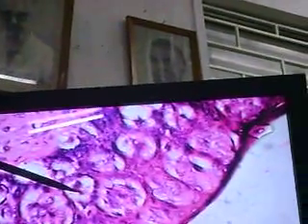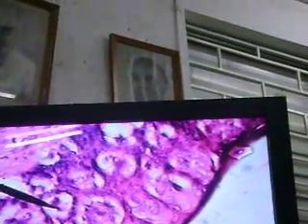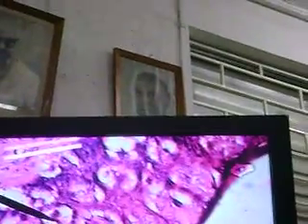Oh, he said that these are taste buds in the circumvallate. What are we talking about here? I thought he said this is just generally supported by the chorda tympani. Okay, what are we looking at? Circumvallate papillae. Well, that would be posterior, the glossopharyngeal nerve. Glossopharyngeal, right. Which nerve is that? The glossopharyngeal nerve. Alright.